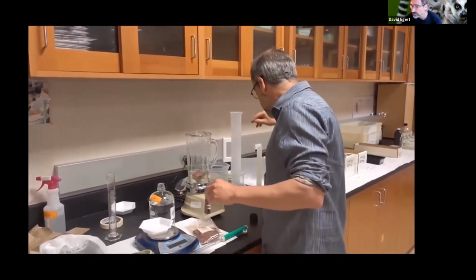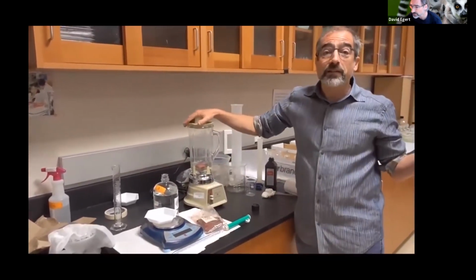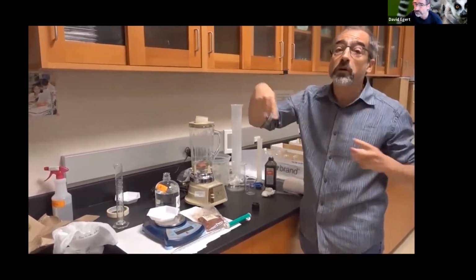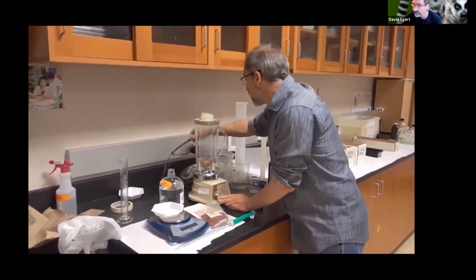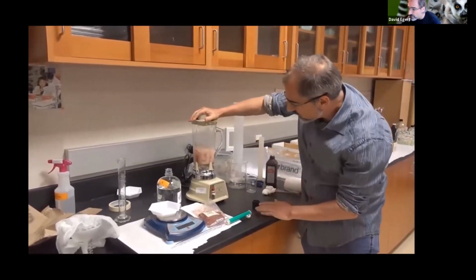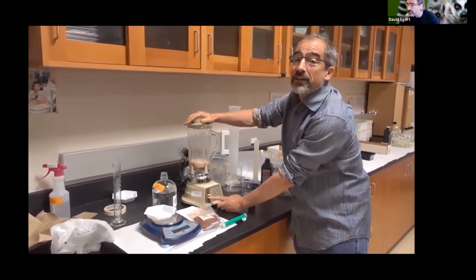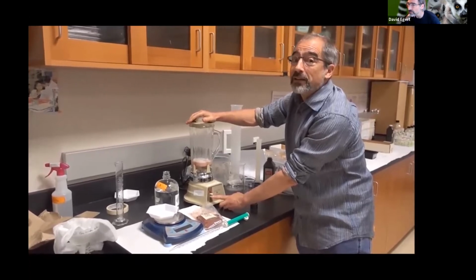We're going to cover it here, so we don't splatter it. Other things that denature enzymes: heat denatures enzymes. So when we blend this, we want to make sure we pulse it and don't just keep it going and going and going and heating it up just from the friction of the blades. If you have one of those really powerful blenders, you can actually make soup in them. If you just keep it on, it actually gets super hot. So we don't want that to happen here.